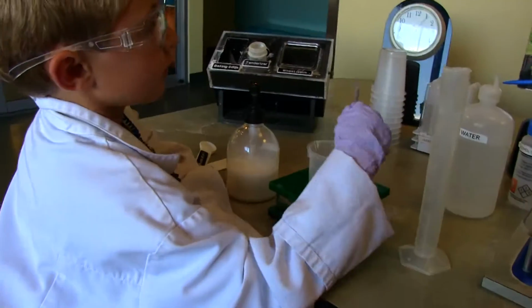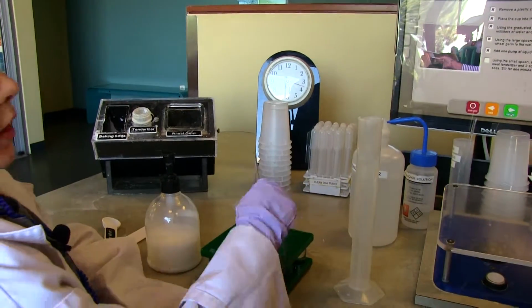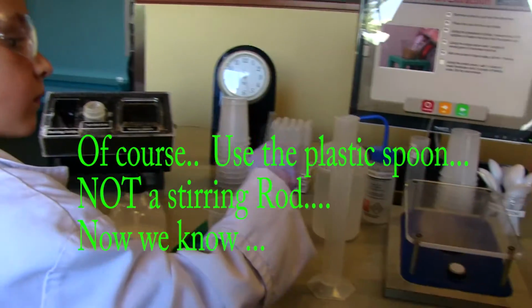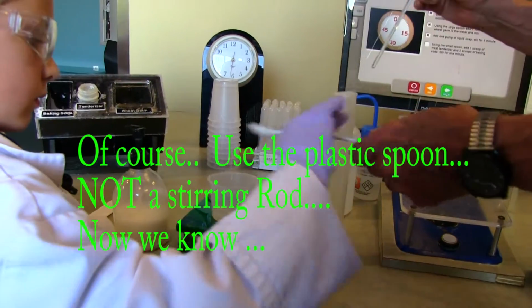What you're supposed to stir with is these. And we'll use the glass rods later on. You'll see what you use that for.